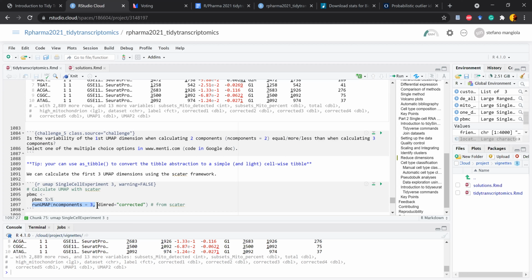Grab the first dimension and understand if it's more or less variable in the 2 cases. And we showed you before how to summarize the data. I can tell you it's a summarize function, as easy as that. And as well, you can ask questions, that's the right channel.